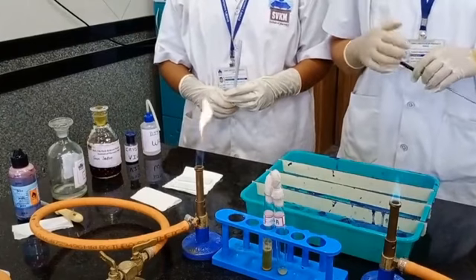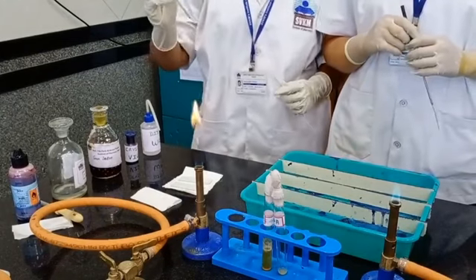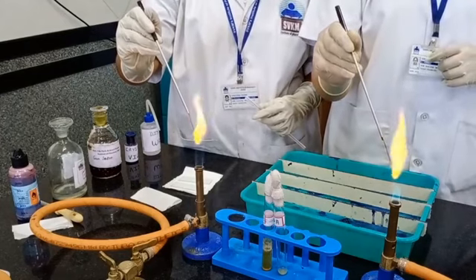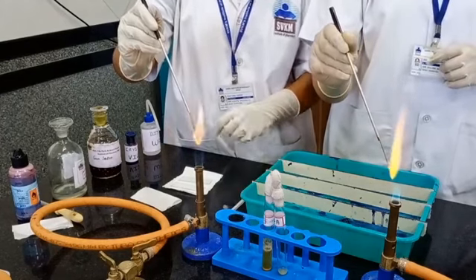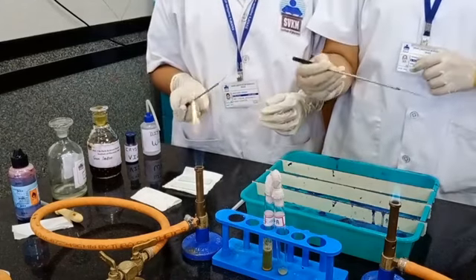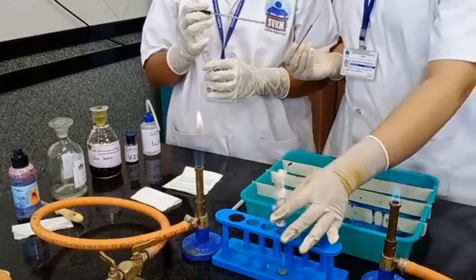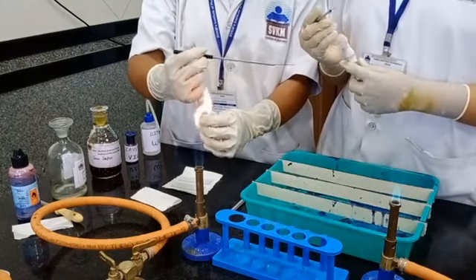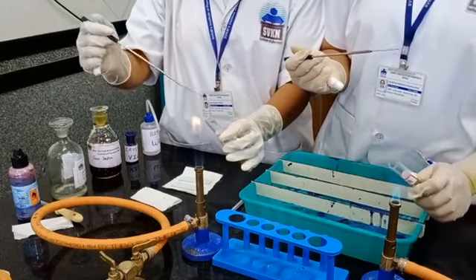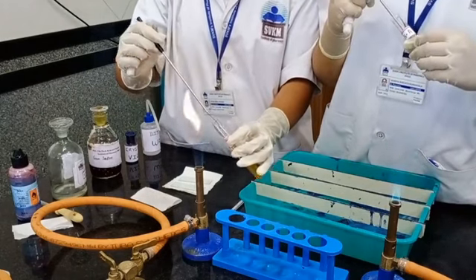The first procedure to be performed is that we have to sterilize the inoculating loop by incineration. We heat it until the loop becomes red hot. Now we have to cool the loop and insert it into the media. The sample is to be placed on the slide.